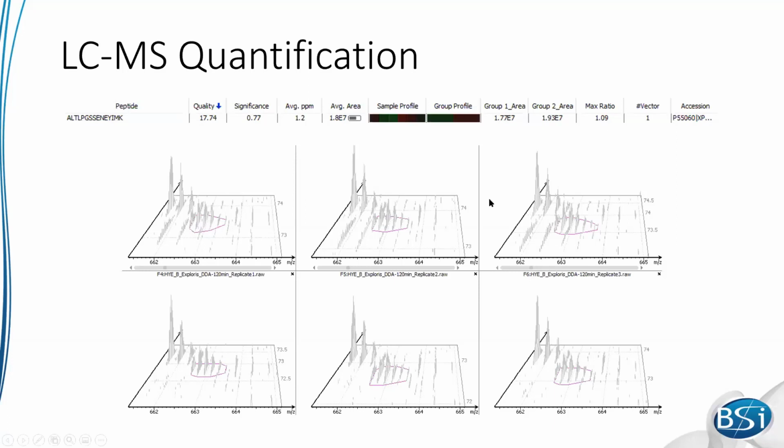You can do this across different samples and match them up. And then by doing that, you're able to get the ratio of that peptide across different samples in order to do a label-free quantification or SILAC quantification. In that case, it'll be within a single result.